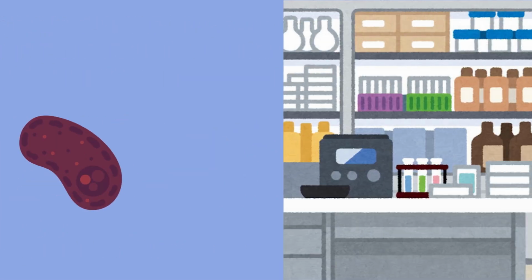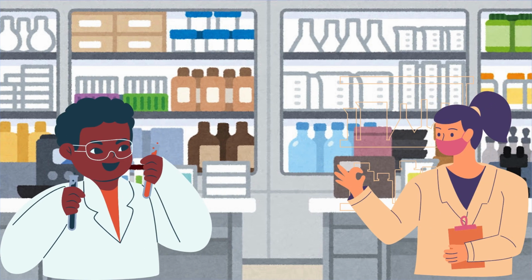Gram staining is more than just a lab procedure. It's a life-saving diagnostic tool. Understanding this simple technique opens the door to advanced microbiology.